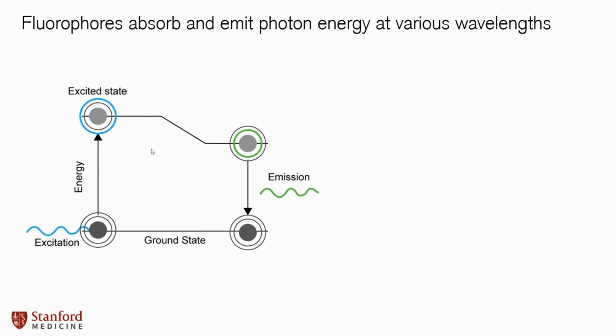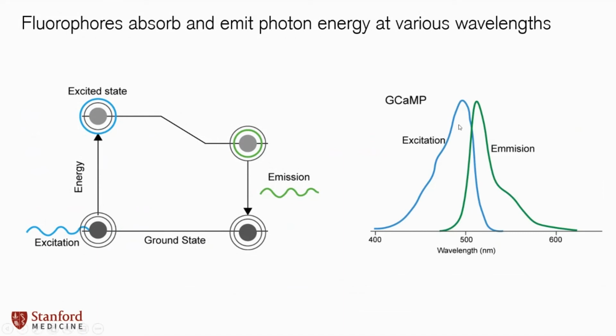of experience. And the principle here is that if I have a fluorophore molecule genetically encoded in, let's say, neurons of interest, or let's say even the whole brain, I can then shine in an excitation wavelength and basically raise the ground state of these molecules into an excited state. And when these molecules relax, they emit back basically a longer, lower energy wavelength. And the excitation emission spectra might typically look something like this.